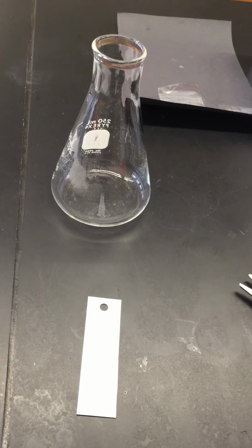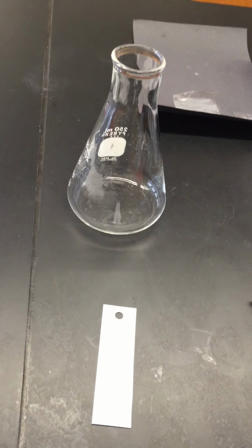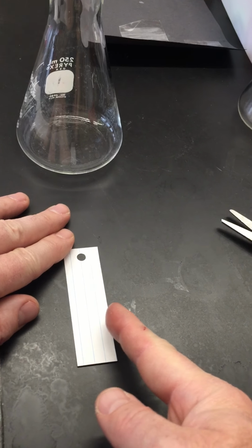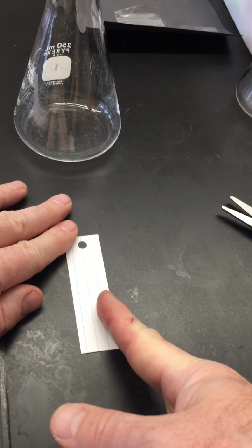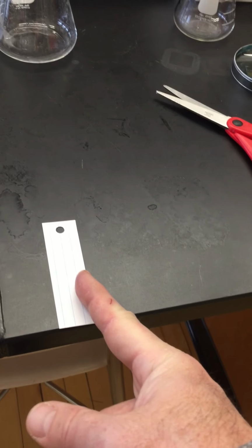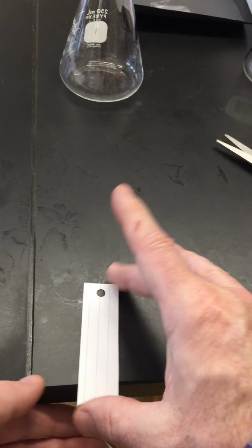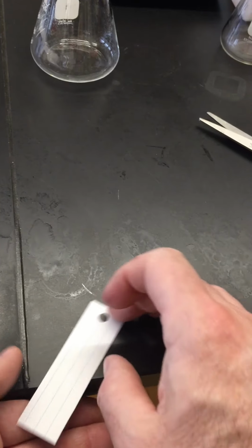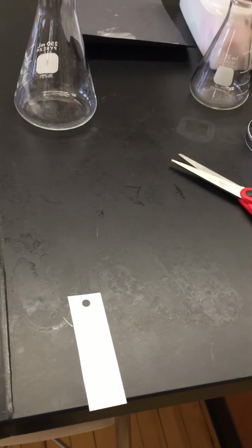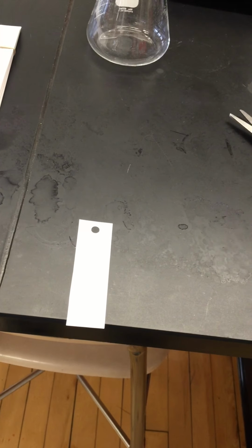I'm going to rub my finger on the outside of my nose or my forehead to get some of the natural oils. Then when I roll my finger on here, I'm going to start on this side. It's actually best if you do it right on the edge of the table. I roll it. Then I'm going to do the same thing on the other side in case this one doesn't come out as well. I'm going to flip it over. I'll try a different finger for this one, rubbing the outside of my nose, up around my forehead.